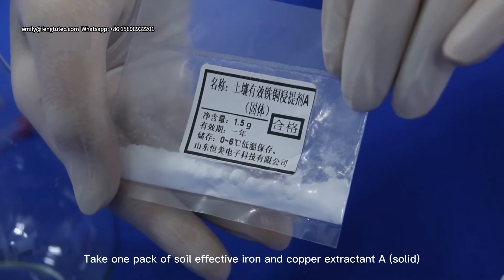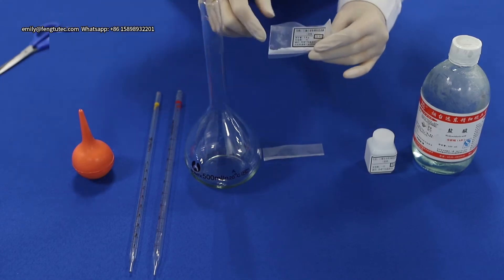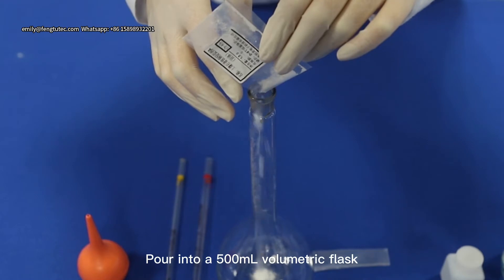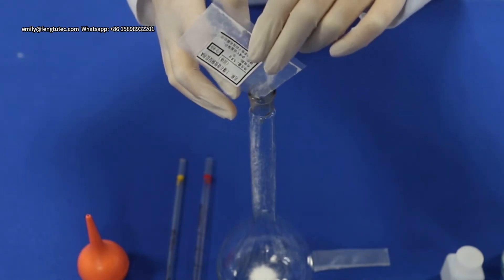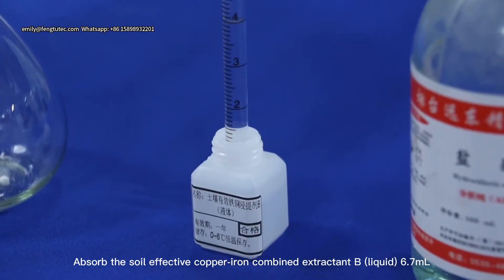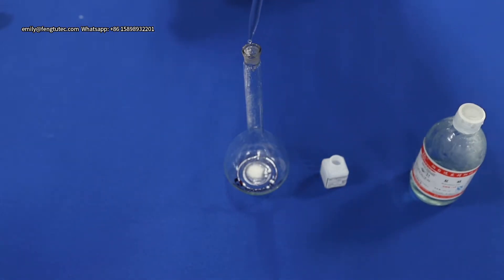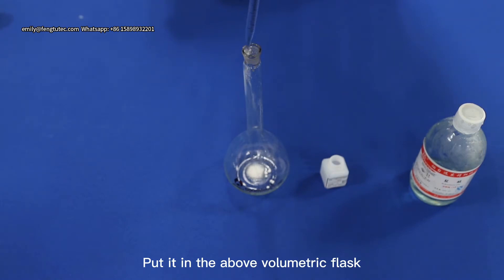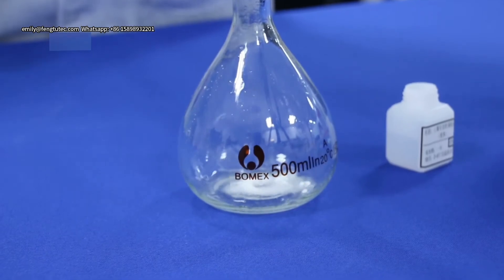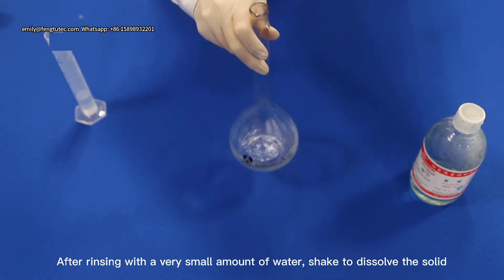Take 1 pack of soil effective iron and copper Extractant A solid and pour into a 500ml volumetric flask. Absorb 6.7ml of soil effective copper iron Combined Extractant B liquid and put it in the above volumetric flask. After rinsing with a very small amount of water, shake to dissolve the solid.